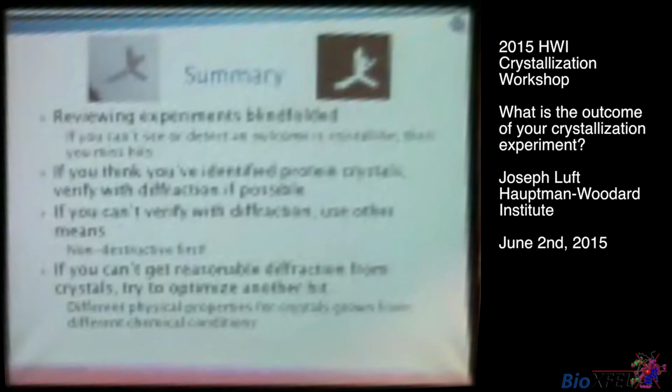Don't be afraid to modify the protein. That's the third rule here. If you don't get crystal hits and you can't see anything worth moving forward with optimization, go back to the protein, reformulate it, try increasing the solubility, and characterize it with static light scattering and dynamic light scattering. Make sure the protein's stable in the way you're storing it for long, reasonable periods of time.